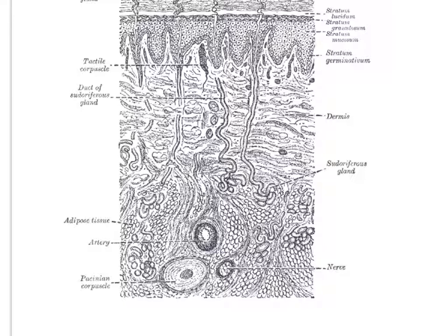So let's just zoom in. We're going to zoom into the yellow magnification, which is 100 times. Once you adjust your magnification, you're going to see in the bottom right that Pacinian corpuscle. And now you see there's a couple of them in there. And then at the top, you're starting to see the translucent layer of that stratum lucidum of your palms, okay? And you also see in there, I'm pretty sure those are the Meissner's corpuscles, the super dark ones. The papillary layer, which you can see pretty clearly here, is super bumpy in your hands and your feet, and that's because there's actually a double layer of the papillary on your hands and your feet, and that's what gives you your fingerprints.